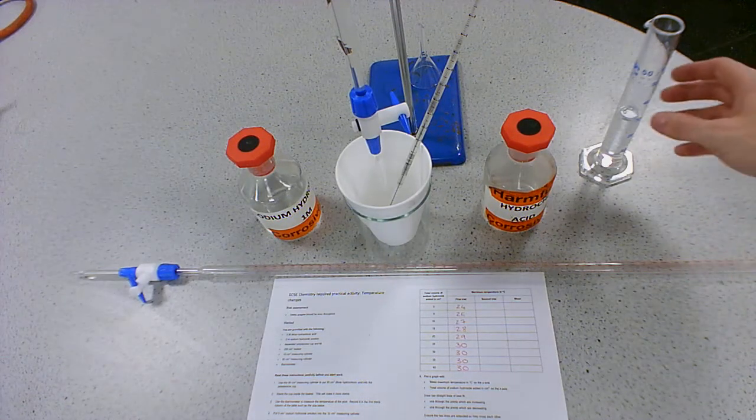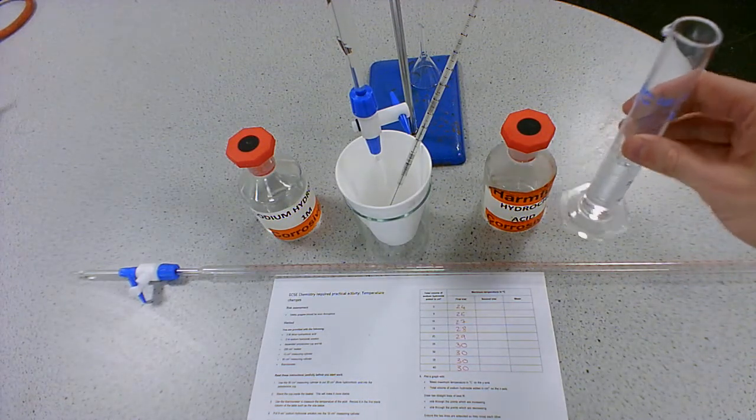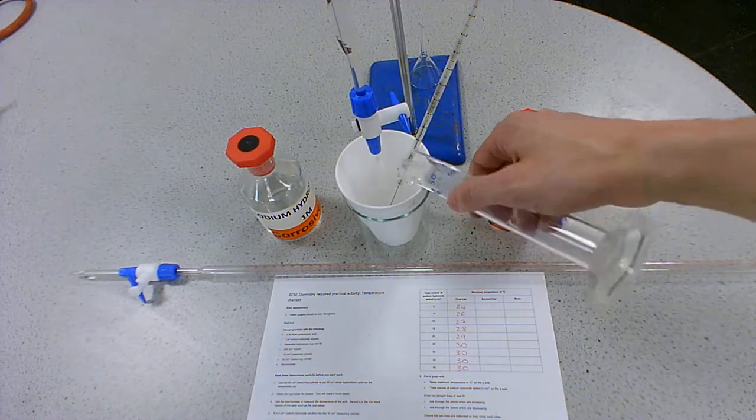So to start with, we're going to have 30 centimeters cubed of our hydrochloric acid into this polystyrene cup.